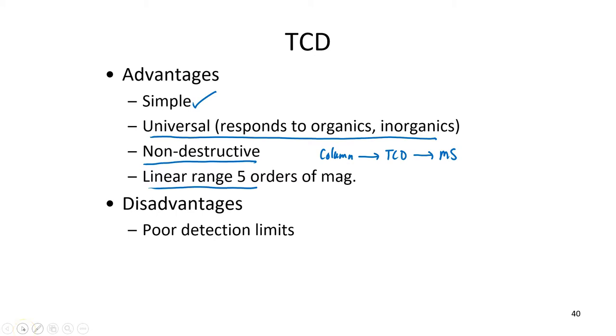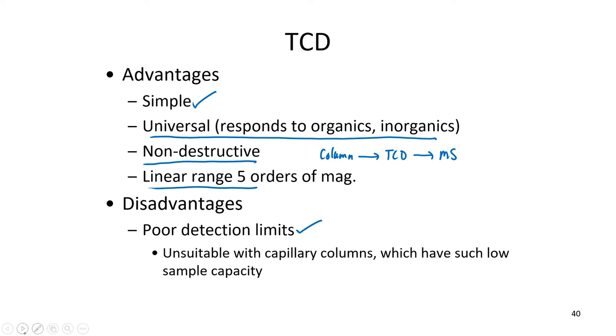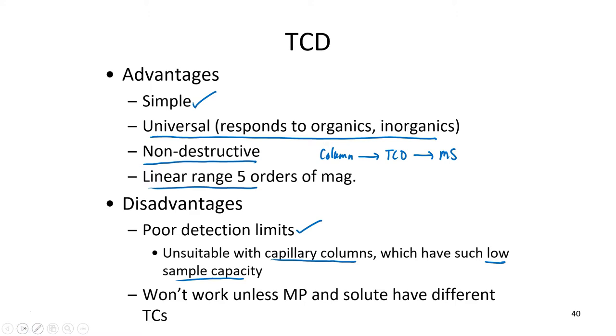The main disadvantage is the poor detection limit. It won't even work with capillary columns, which remember have such a low sample capacity. And also, as you can probably guess, it won't work unless that carrier gas and solute have different values for thermal conductivities. So that's all I have to say about the TCD.